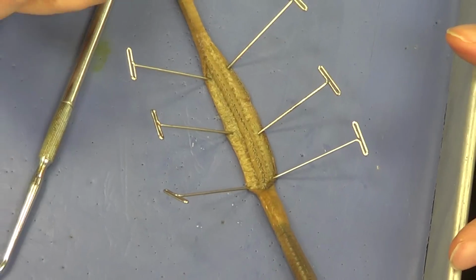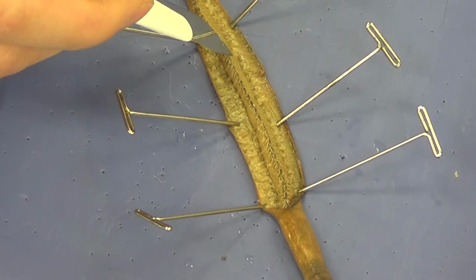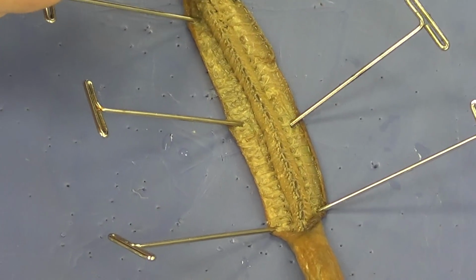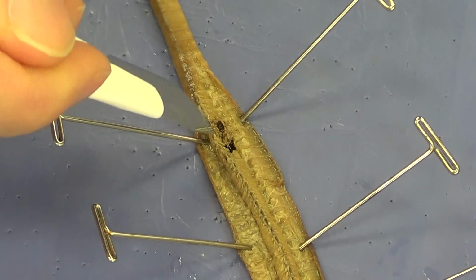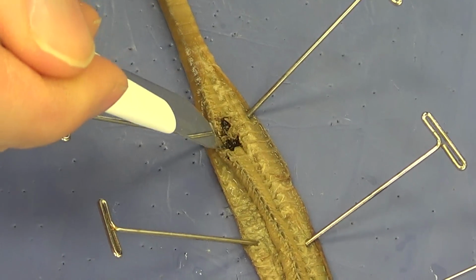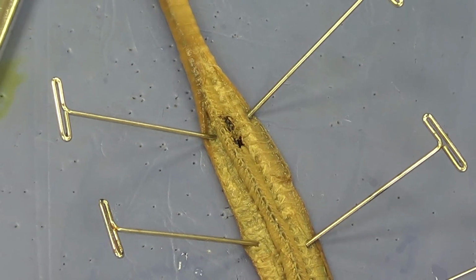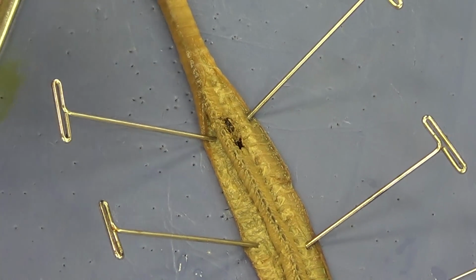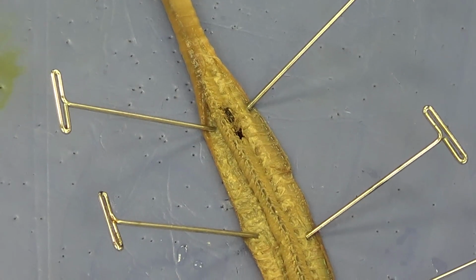Now, if you happen to cut too deep, I'm just going to go ahead and show you what's going to happen. I'm going to cut a little too deep here, and you can see the soil begin to ooze out. That's an indication that you have cut too deep. You need to back off and go a little bit more shallow. Now, I'd like you to practice and proceed all the way down to the anus.